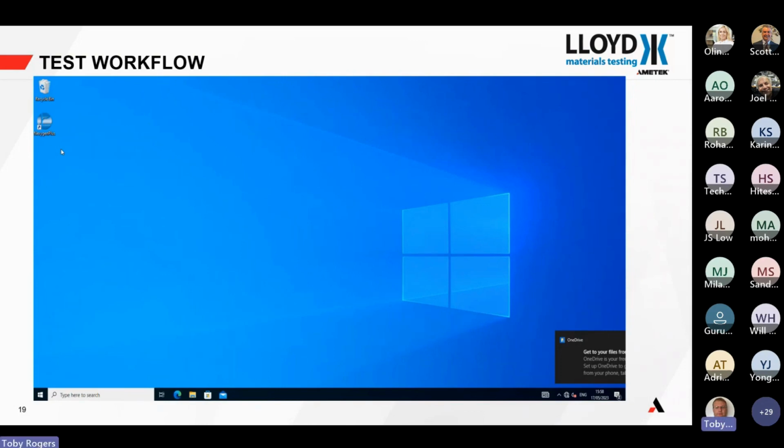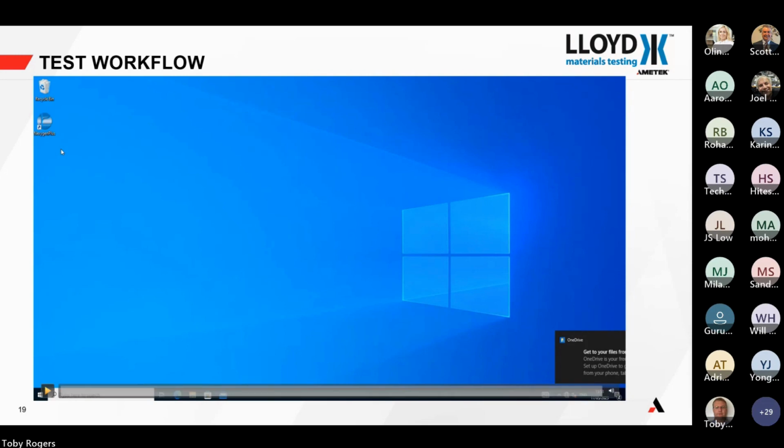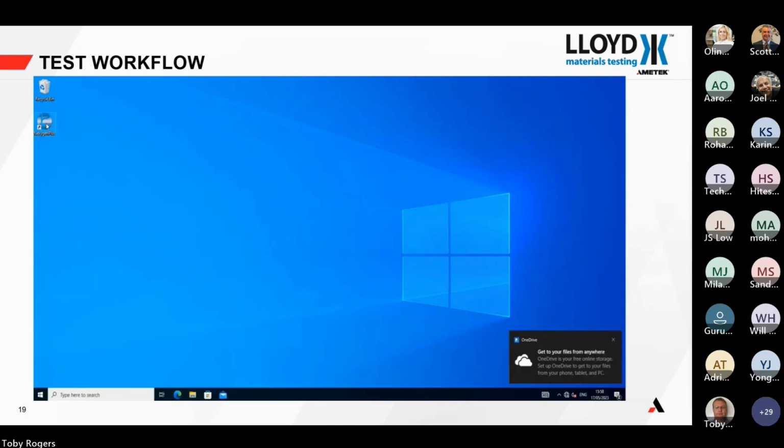So now that we've actually deployed that test method, we can log in as an analyst and perform a test. So we're going to open the software.